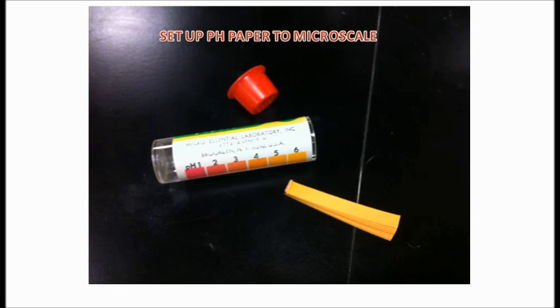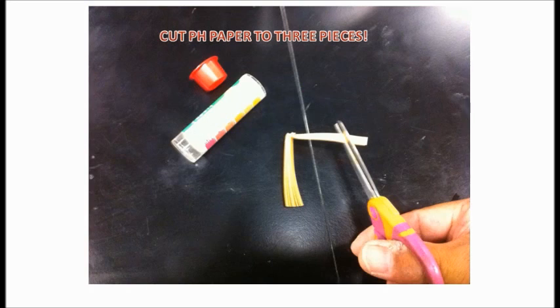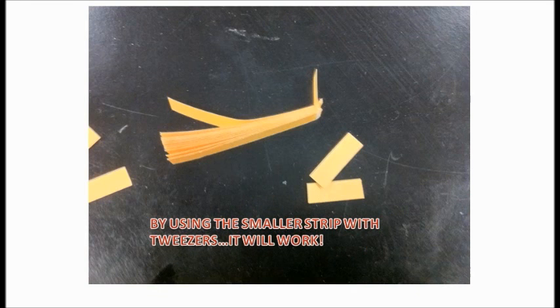We're only going to need a smaller amount of it, so that's why you are cutting it in thirds. Cut the pH paper in 3 pieces and make it as equal as possible. You should come up with a size like this. Large enough to be able to hold with your tweezers, but small enough so that we can fit it inside the test tube. Remember, we're thinking microscale.